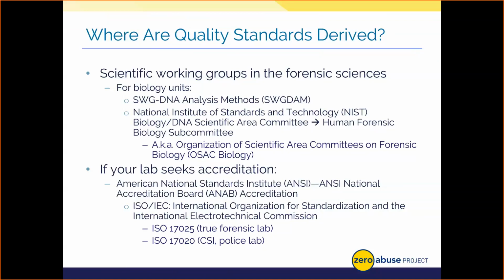They met in 1988, and their goal from their first meeting was to bring scientists all around the world to validate forensic DNA methods and share protocols and best practices to establish guidelines for forensic laboratories. The forensic DNA community abided by the guidelines from SWGDAM, and as a result, those guidelines became de facto standards that were recognized by courts as minimum requirements for a quality forensic DNA analysis program.